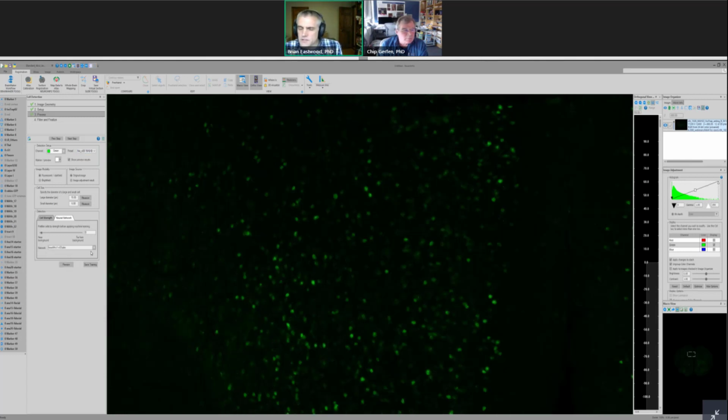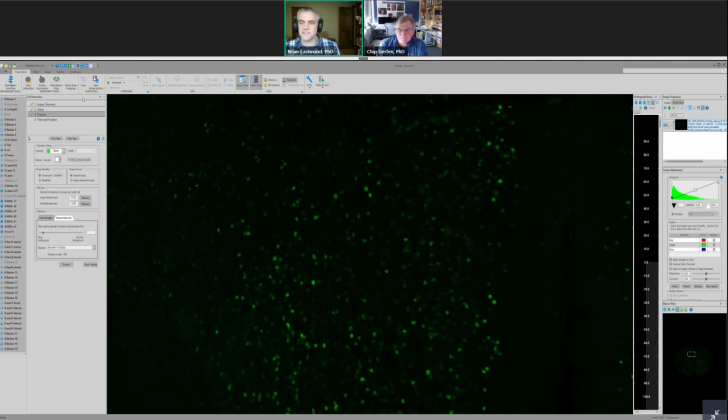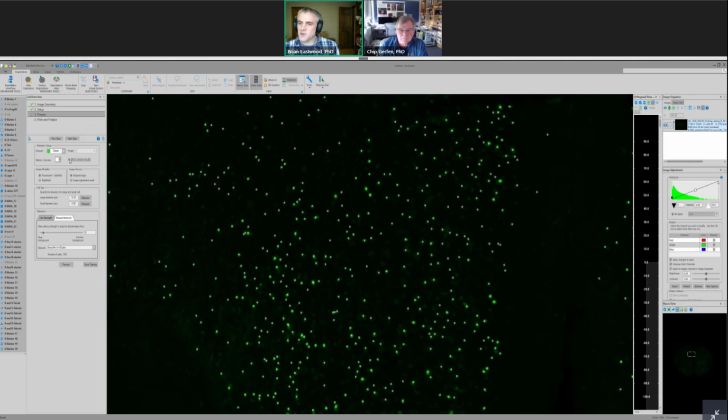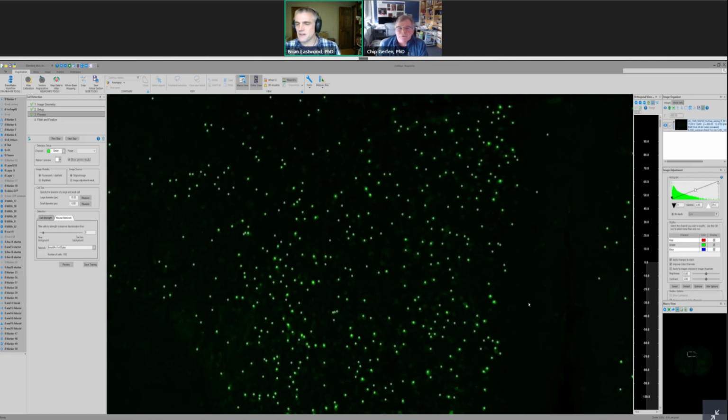And I think I'll just say that one of the challenges that you talk about with working with c-fos is actually that labeling. Creating a consistent set of labeled images where we're looking at cells where with c-fos the expression is very variable, right? It's not just on or off; it's a matter of degrees. And so when you're labeling, you choose what level of expression you would accept a cell versus reject a cell. And I think that's one of the challenges.